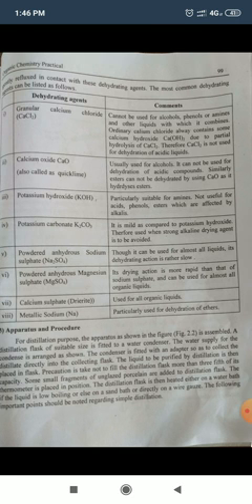First one is granular calcium chloride, that is CaCl2. Comments: it cannot be used for alcohol, phenol or amines and other liquids with which it combines. Ordinary calcium chloride always contains some calcium hydroxide, that is Ca(OH)2, due to partial hydrolysis of CaCl2. Therefore, calcium chloride is not used for dehydration of acidic liquids.